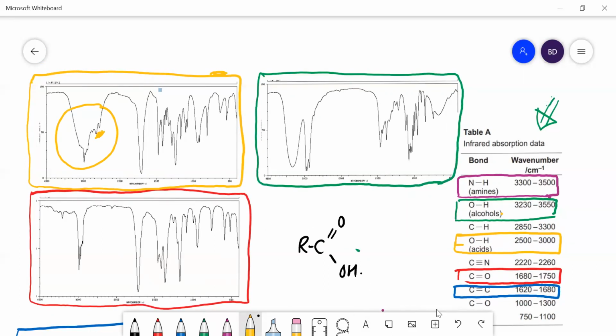What I should also mention about carboxylic acid, if you suspect it's carboxylic acid, it's usually fairly obvious it is, but of course they also contain the carbonyl group, which I've color-coded in red there. That is at 1680 to 1750, and that's that peak there. It's always very deep and it's quite broad. It's a good chunky peak, you know? It's not like a little insignificant thing. Okay, so that is characteristic of the C double bond O.